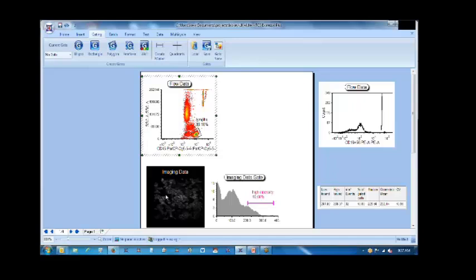That was accomplished by the freeware CellProfiler, which some of you might be familiar with. We can also do that with ImageJ. So even if you don't have an AMNIS or other fancy image cytometer, if you want to start analyzing your images in a more quantitative and objective way, that's something you can do with FCS Express too.